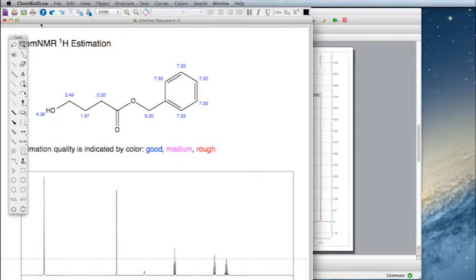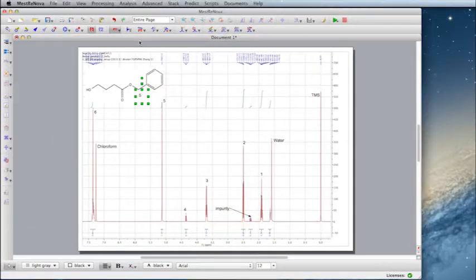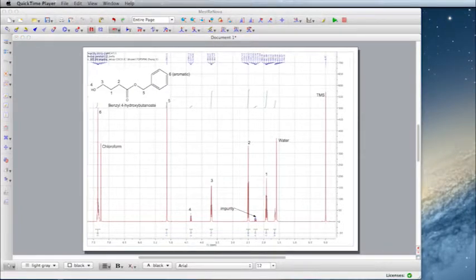When analyzing your NMR spectra, you may find many unidentifiable peaks that do not belong to your compound. If this is the case, you may want to consider looking at characteristic peaks of reaction intermediates and possible side products that may potentially be formed in the reaction. Being able to explain and justify your data is where the real chemistry comes in. The complete processed NMR spectrum should be similar to this example.